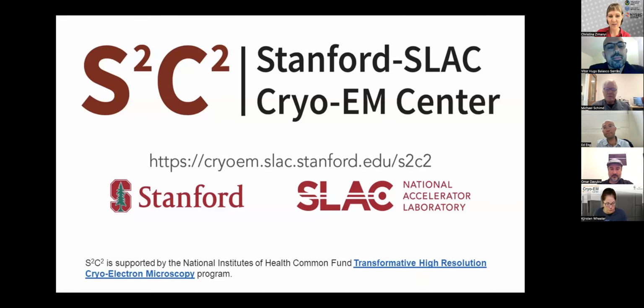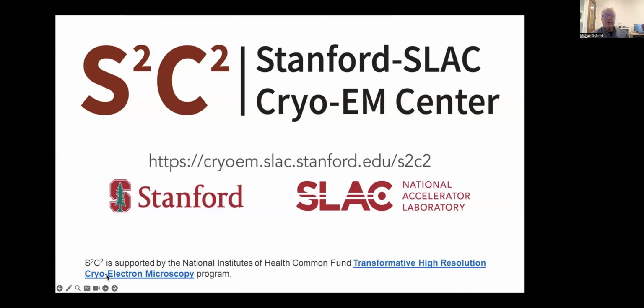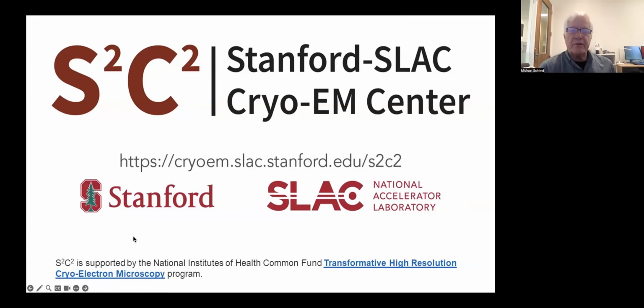Good morning. I'm Mike Schmid from the Stanford SLAC cryo-EM Center and from the Stanford cryo-EM Specimen Preparation cryo-ET Center. And we are installing our 4th Krios, which will have all the modern bells and whistles on it, and two other microscopes for screening and training. And for those who are interested in cryo-ET, we are installing a new Hydra to complement our Aquilos for specimen preparation of cryo-ET. It's going to be busy installation summer, but you're all welcome to sign up.